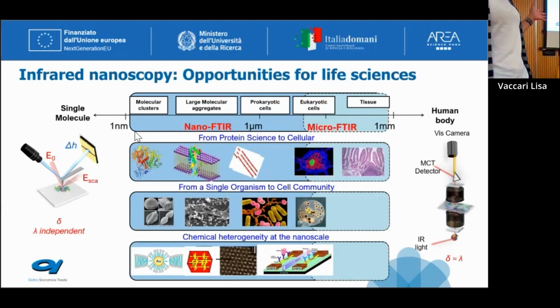For the nano stuff, the examples that I showed you before are mostly related to microscopy or spectroscopy. On nanoscopy, it's very demanding up to now to work with biology because the technique was invented by physicists, and the maximum of complexity that physicists can understand is a silicon piece with some circuits on top of it. But biology is much more complex than this.